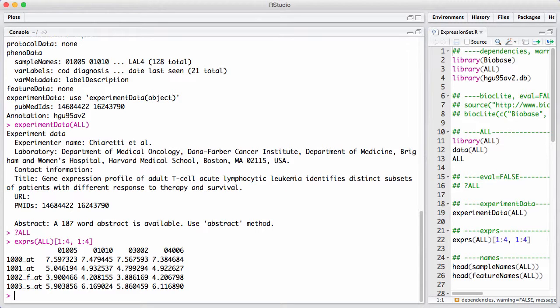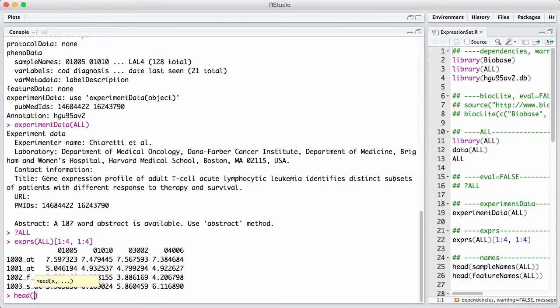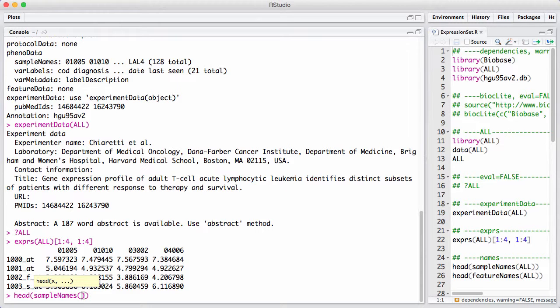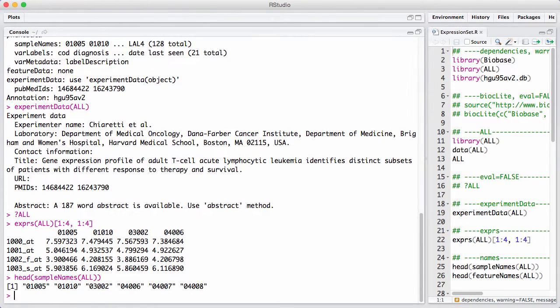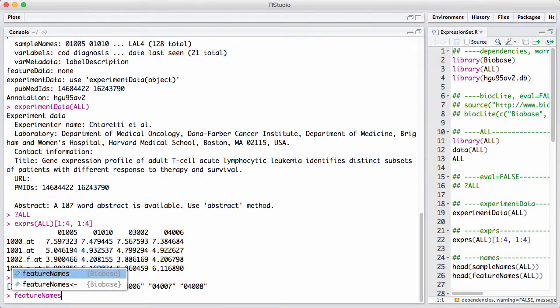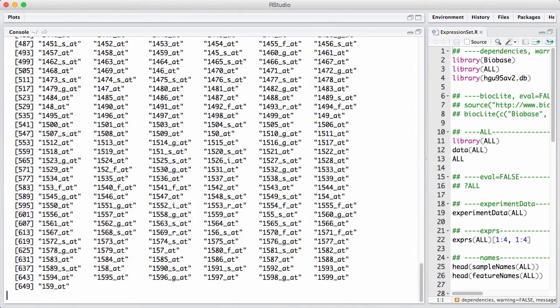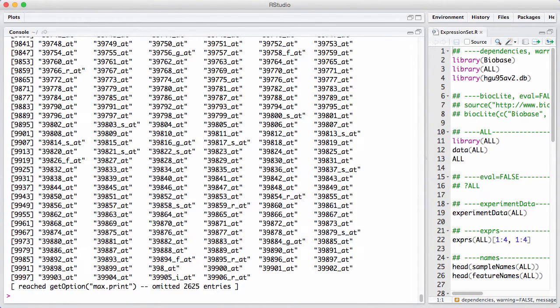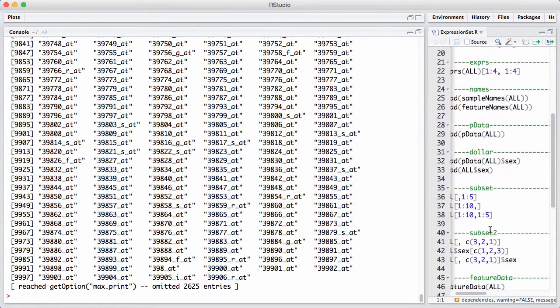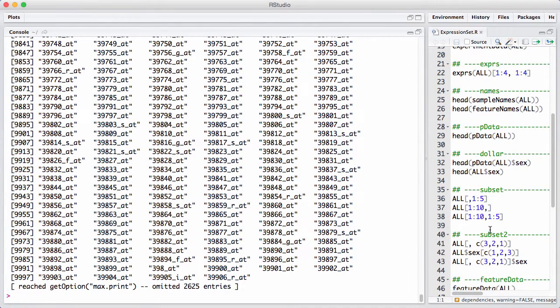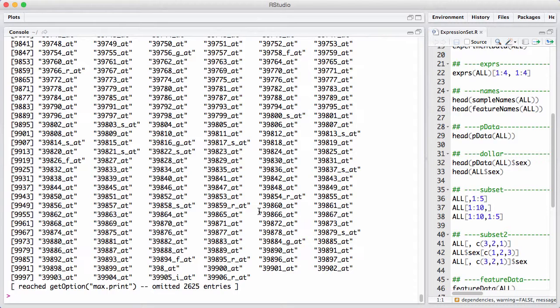And on the columns, we have these numbers that are sample IDs. You can get the sample names and the feature names by using the sample names accessor function and the feature names. Oh, we printed them all. And well, that's easy to get, like these names here that we use quite a lot. This was the expression measures.